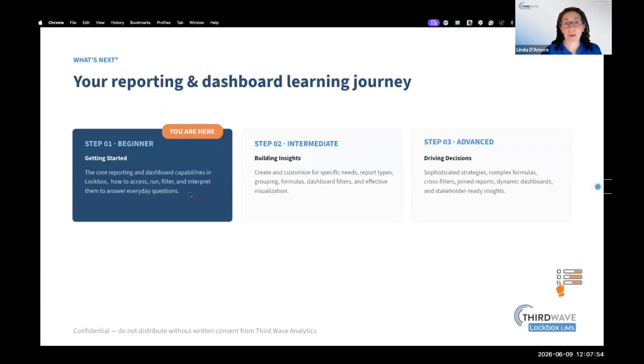So we talked about this webinar as a learning journey. Today we're going to show you the basics: how to create a report and how to create a dashboard. Rhys is also going to show a little bit of an advanced feature like creating a formula, but there is a lot more that we could not fit in one webinar.